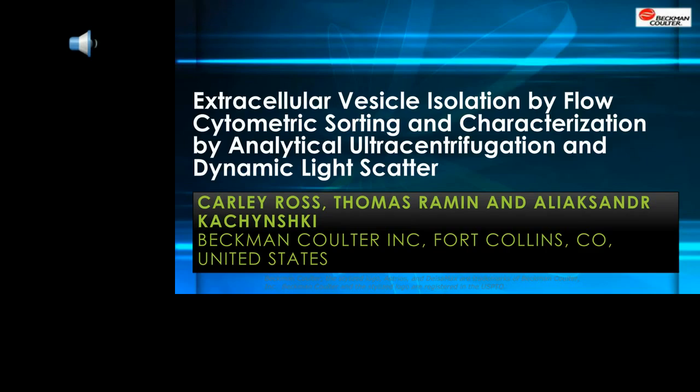It looks like 36.1% actually do not study EVs. They're probably here for the flow cytometry part. 25% use differential centrifugation. 16% use density gradient centrifugation. 19% capture their exosomes and extracellular vesicles using other methods.